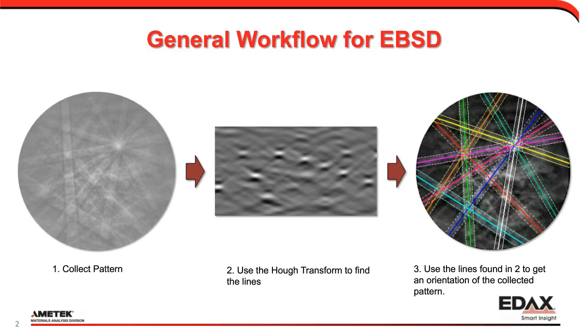than they would like. Now, again, step 2 is really one of the most important parts of EBSD, this Hough Transform. And while I think it's not all that important to understand how the Hough Transform is built upon, and honestly, there's YouTube videos out there that cover that way more than I'm going to cover in this little webinar, you have to understand how the parameters that we deal with to use the Hough are more important than actually how the Hough is made.